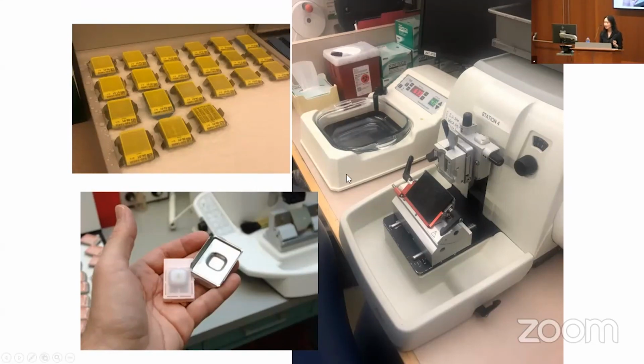Then what happens is this gets clamped onto this thing here. And then we put very sharp blades mounted onto the knife mount here. And these blades are frequently switched up because they shatter. And you have a lever that I'm not showing here. As you turn this lever, this knife goes up and down onto this block of solidified wax where your tissue specimen is. And so you might imagine it needs to be placed just right. It can't be placed like, up. It has to be placed flat so that we can see the full surface. And that's what Zhang Min was doing with the embedding, trying to make sure that it's oriented correctly. So it goes up and down onto this wax.